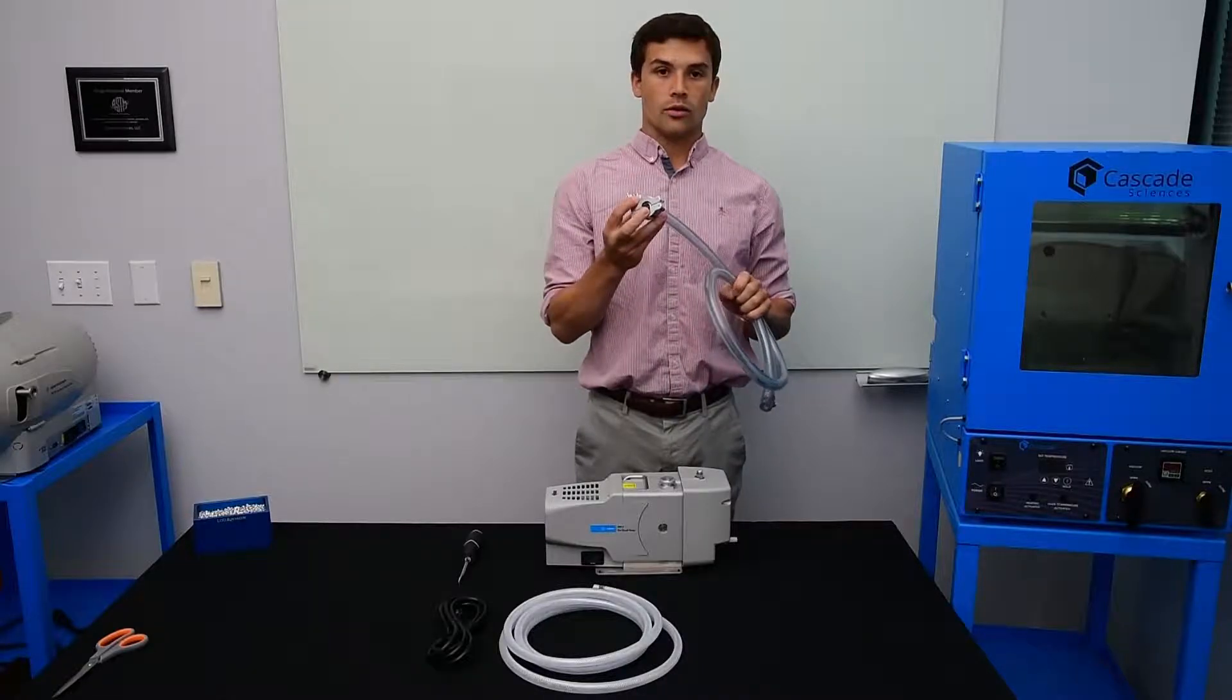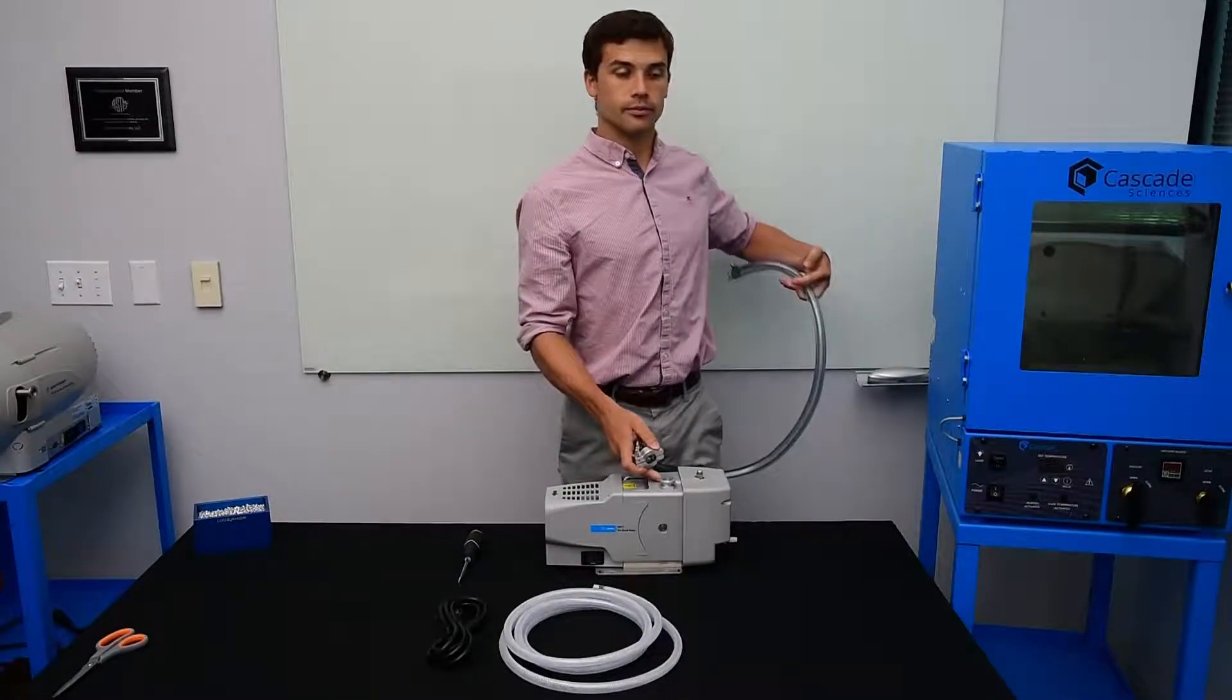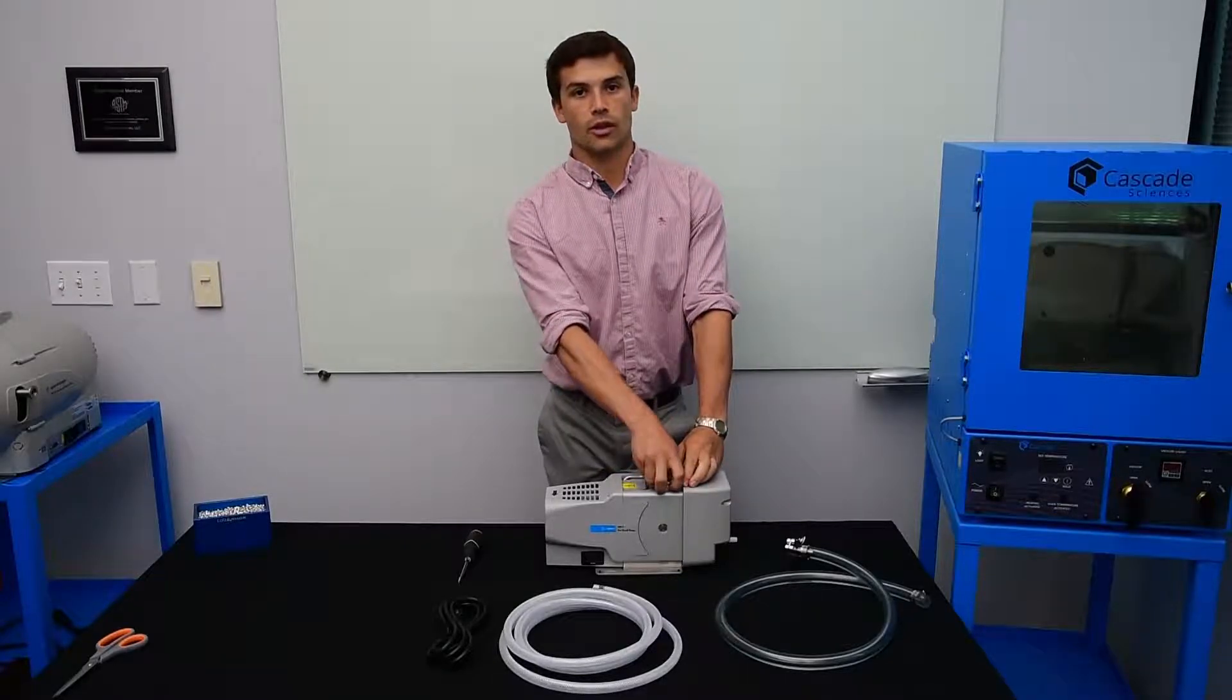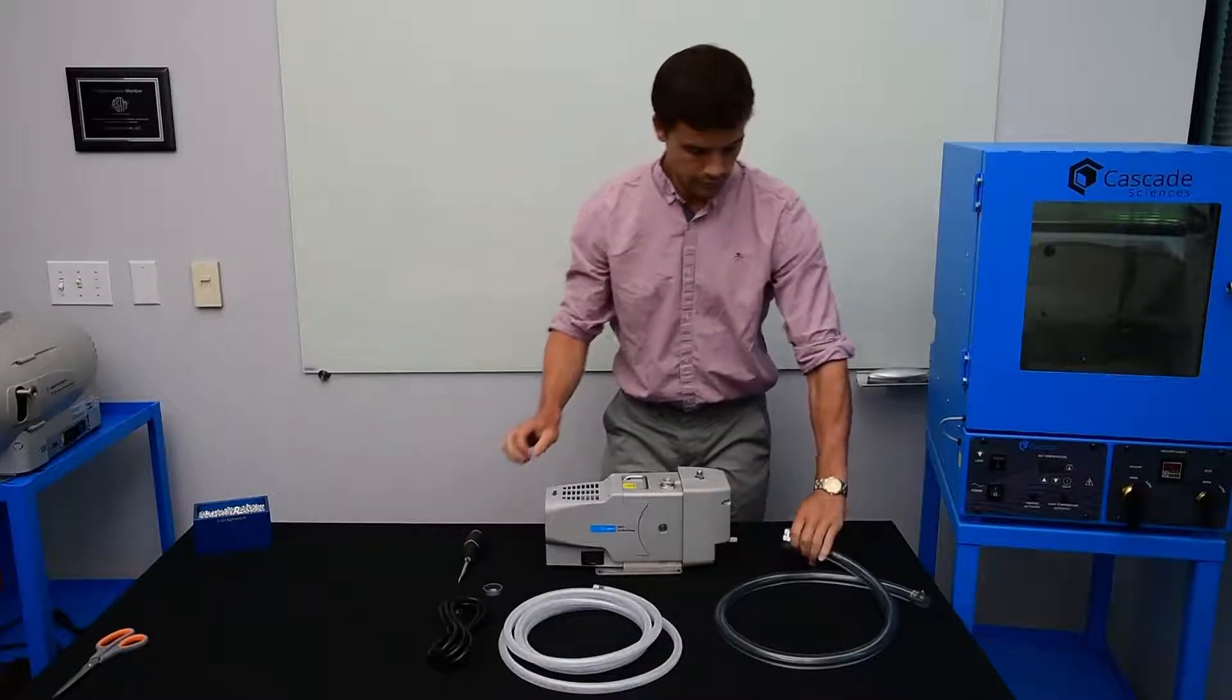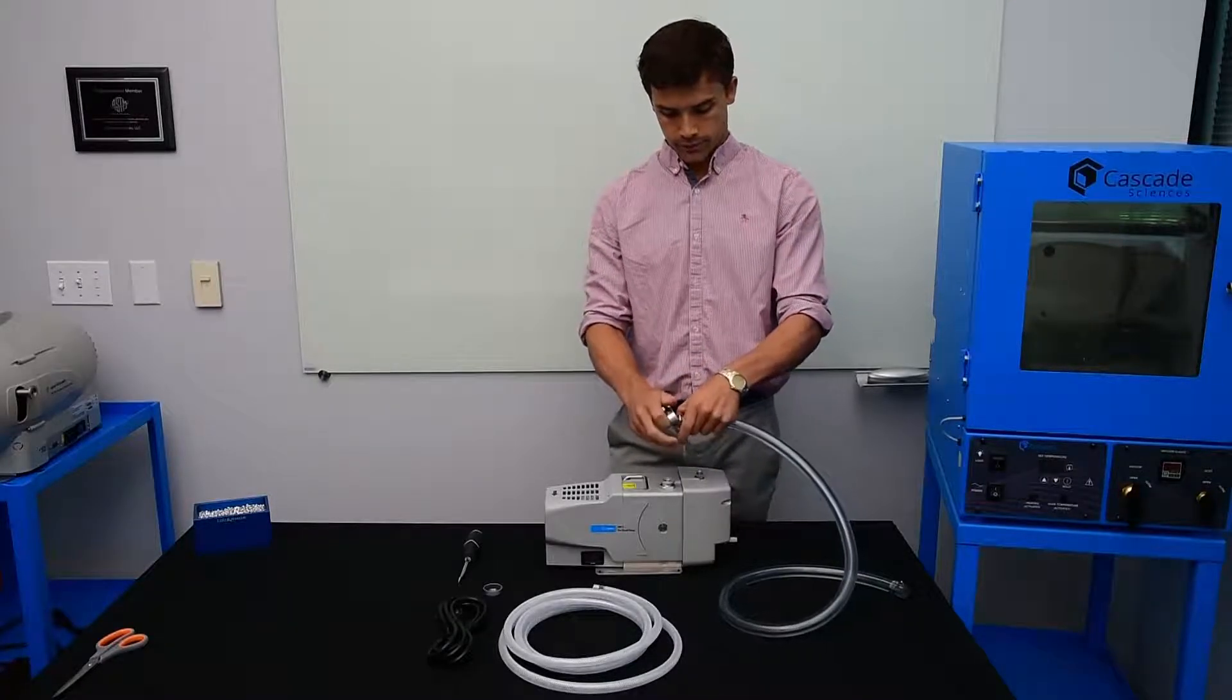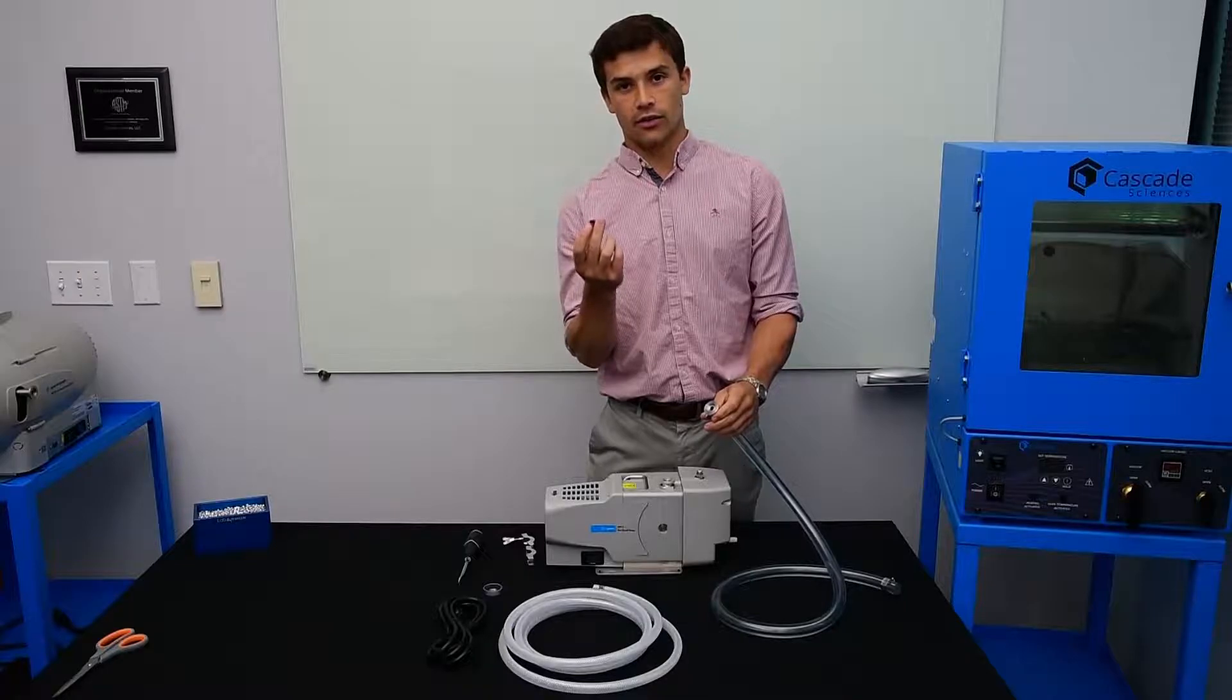We're going to start with a vacuum hose. This is going to connect from the pump to the oven. The pump ships with a plastic cover that we're going to go ahead and remove. And this is a KF-16 quick clamp. Make sure you don't lose the centering ring.